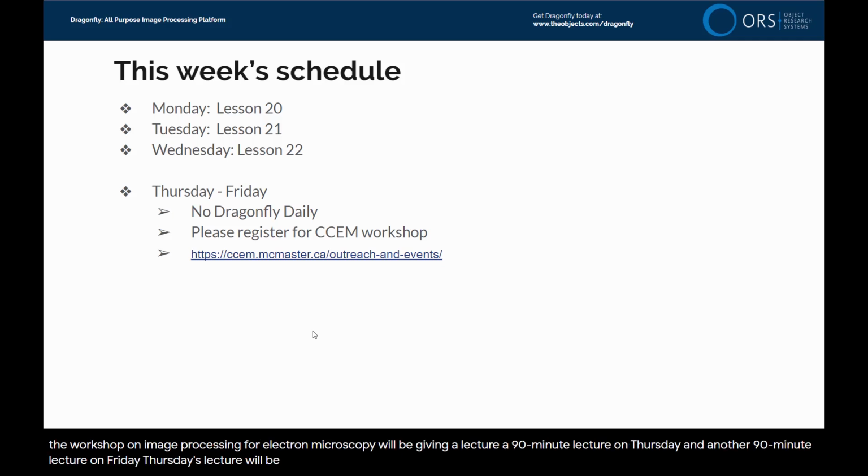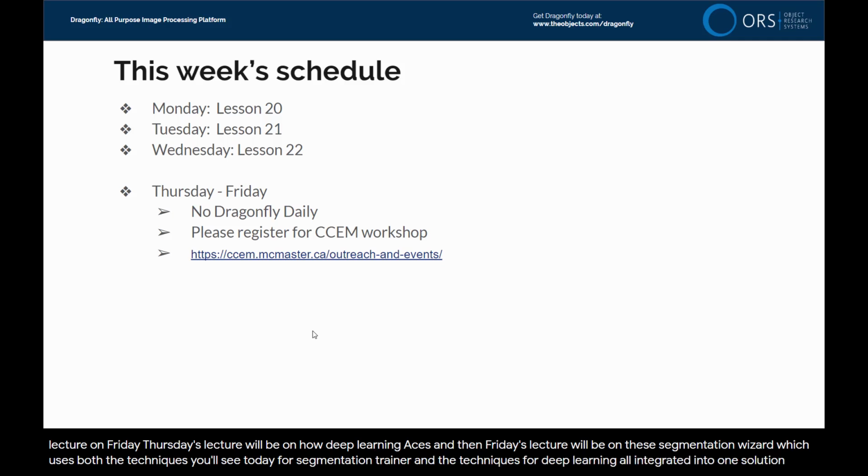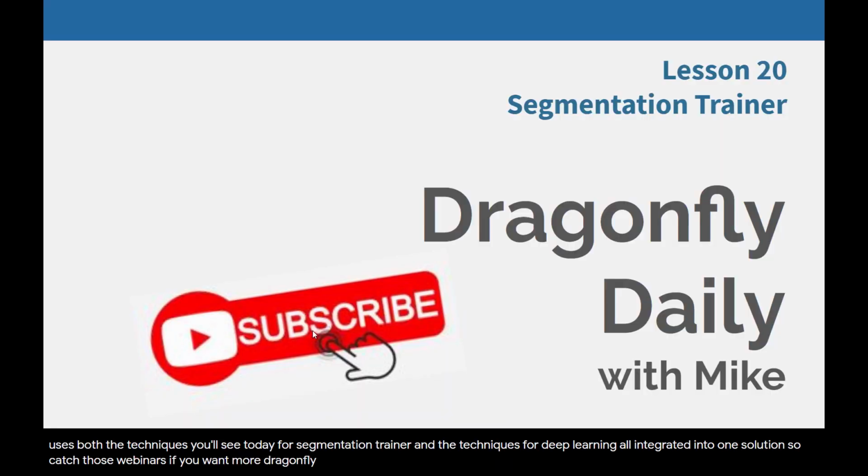Thursday's lecture will be on how deep learning obviates image processing needs in many cases, and then Friday's lecture will be on the segmentation wizard, which uses both the techniques you'll see today for Segmentation Trainer and the techniques for deep learning all integrated into one solution. So catch those webinars if you want more Dragonfly content.